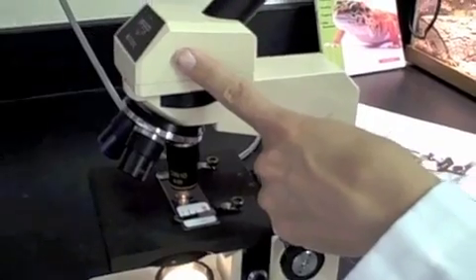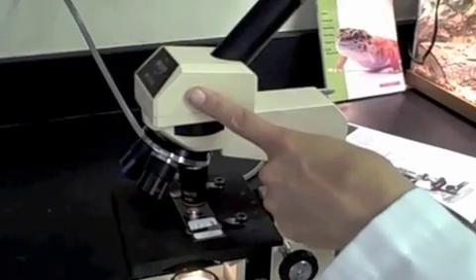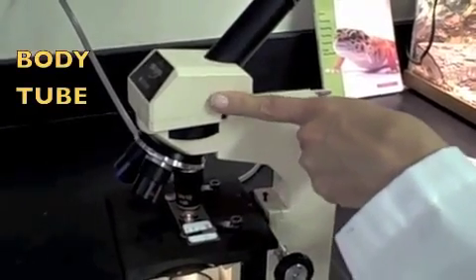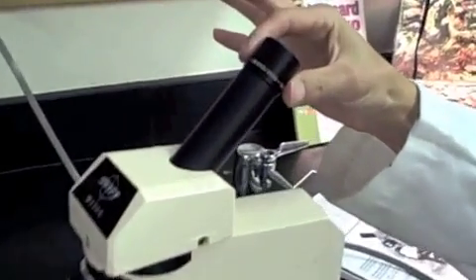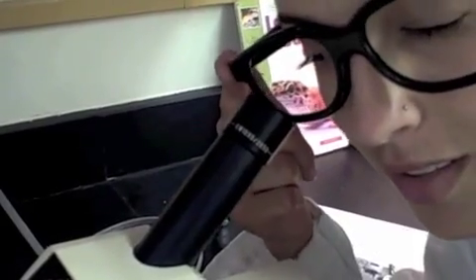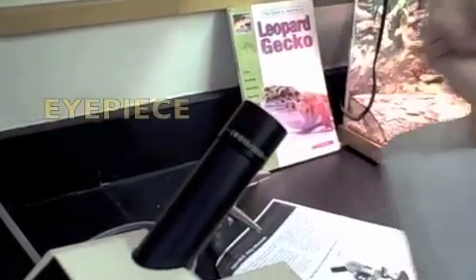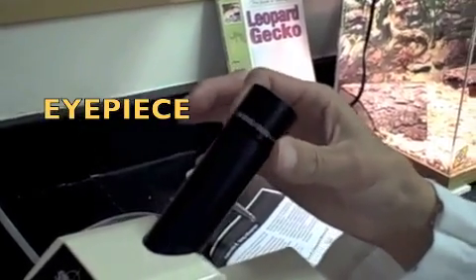Now if we move all the way up here we have this piece. Tell us what that piece is called. It's the body tube. Good job. And we're almost done. We're up to the last piece right here. Remember this is the piece I look through with my eye. What's it called? Yep, that's the eyepiece. Easy one. And it has a lens that magnifies how much? Yeah, ten times. Perfect.